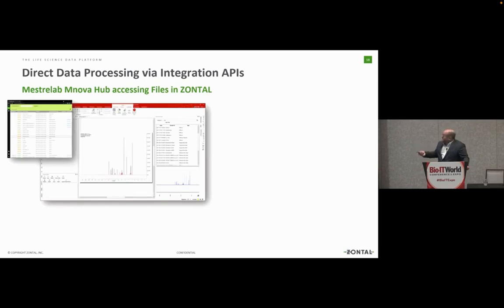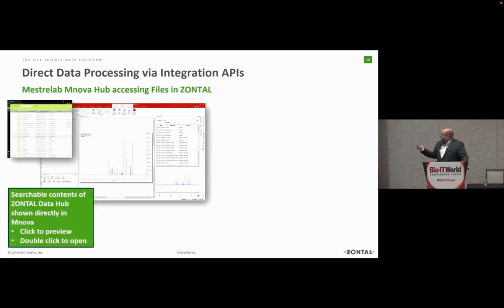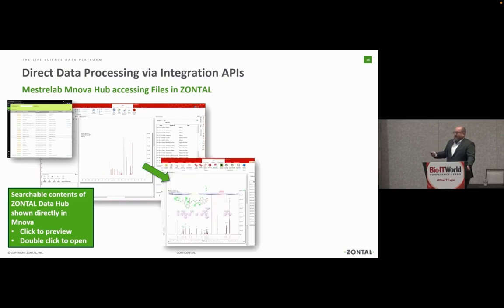This is again an NMR, yes, and work with it, and even save it back and create a new version of that information package that I was talking about, because now they have analyzed the data, so they're adding just another layer to it. And it is, of course, searchable content, and it's literally clicking on it, loading it as if it would be a normal file. But it's not only a normal file.